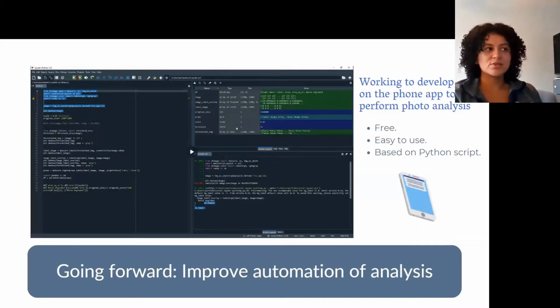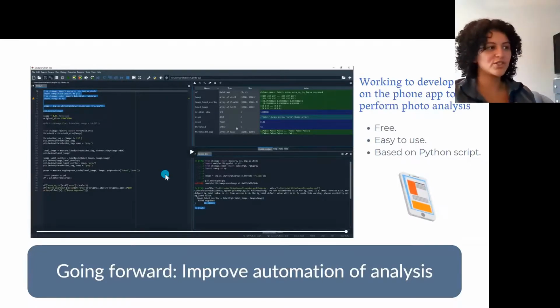And I think the advantage with this would be that you can name, for example, a dark black color as number 0. So the program will tell you how many zeros are in the picture, and you can make that more automatic once you figure out how to code it perfectly. But that is something that can be created as a cell phone app, and it's pretty easy to use. You don't need to edit so much.